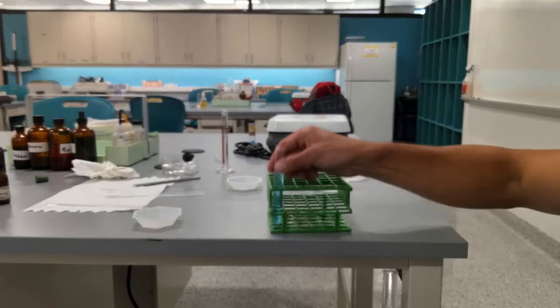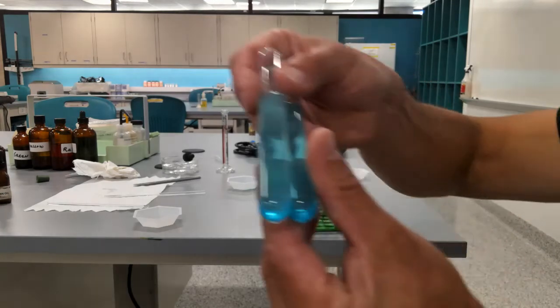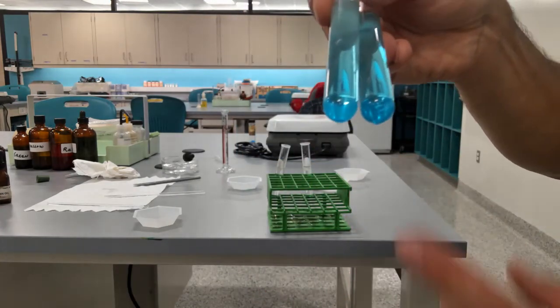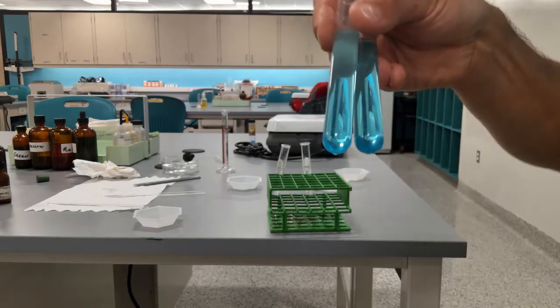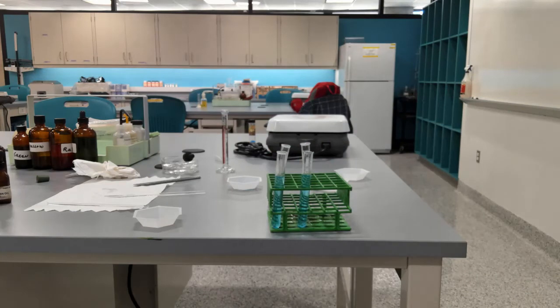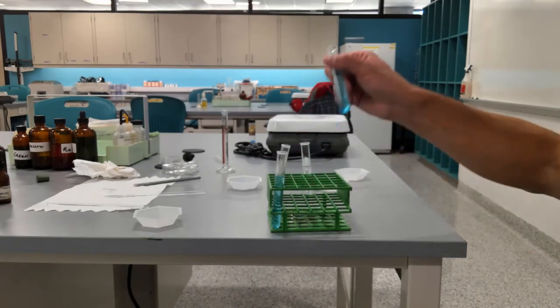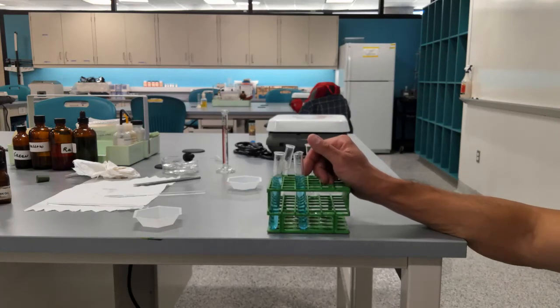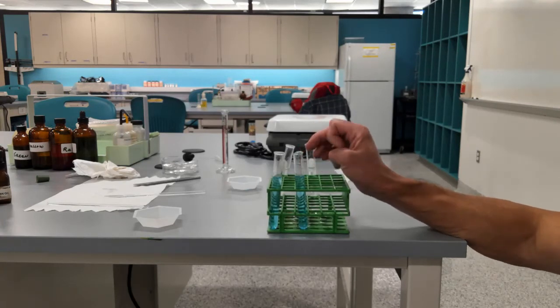At this point, look, the cold water sample still contains some precipitate. The hot water sample is fully dissolved. So considering that the temperature difference between the two was very, very small, very marginal, even with this we can clearly see that diffusion, dissolution happens faster in the warm water.